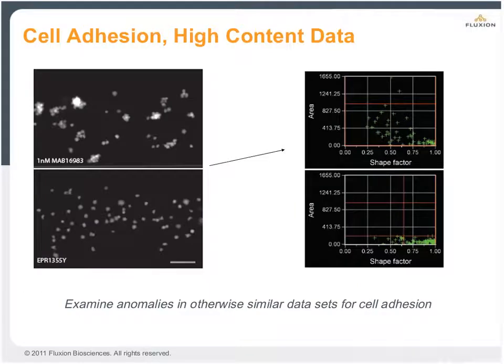What is very interesting about capturing data using microscopy for cell adhesion is that unlike using a plate reader, you collect more data than just the raw fluorescence or the bulk fluorescence. In this case, 2 inhibitors against the same target are used, which would score exactly the same in a plate reader assay on the left panels. However, here you can see that something funny is going on with the panel at the top, a potentially undesirable outcome of the adhesion inhibitor which is cellular aggregation.